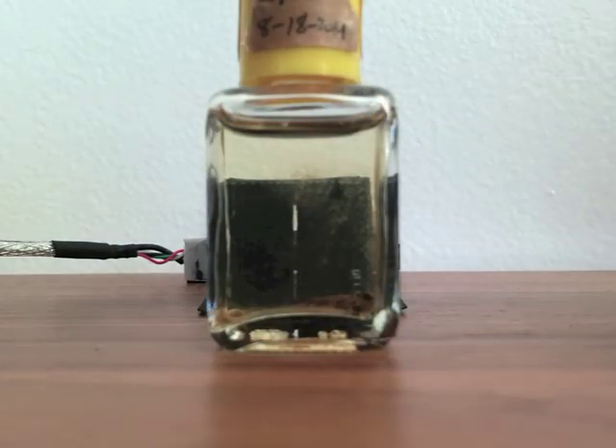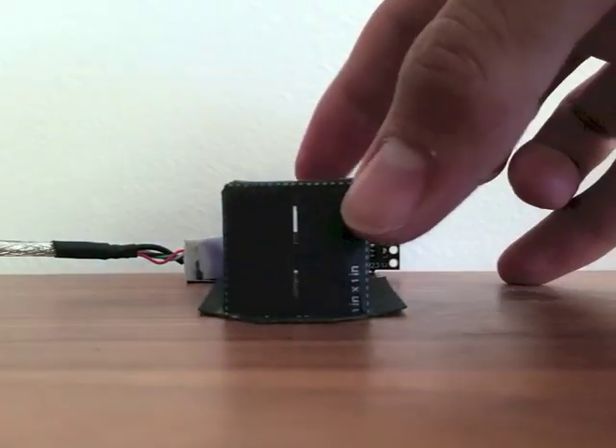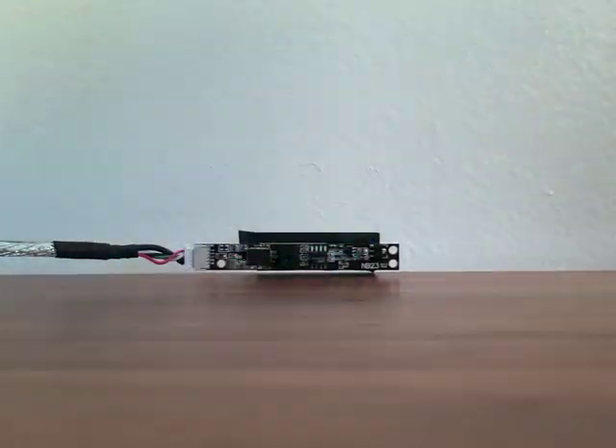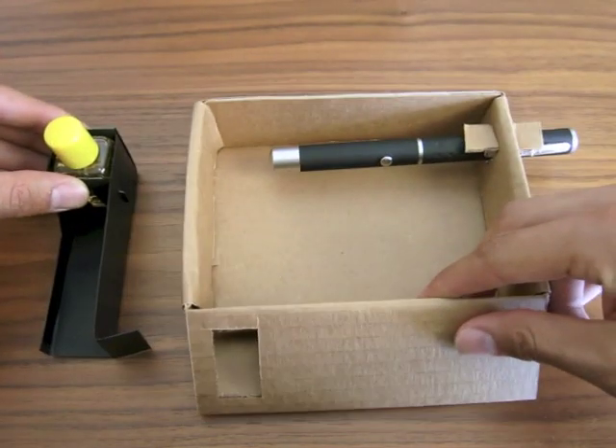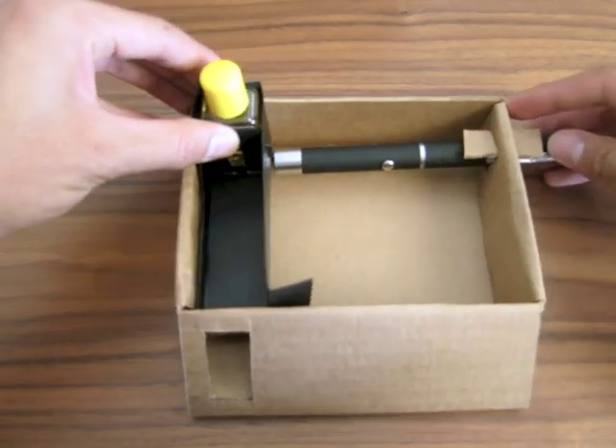It uses a UV laser, a narrow slit to let a beam of light in, a piece of DVD to diffract the beam, and a webcam. These parts fit into a carefully sized cardboard frame, and then into a light-proof box like this prototype.